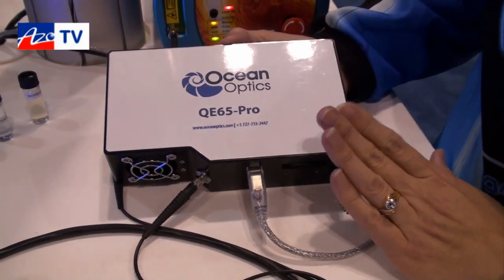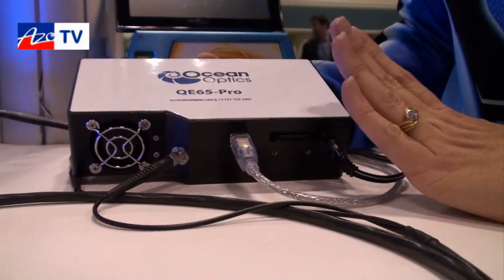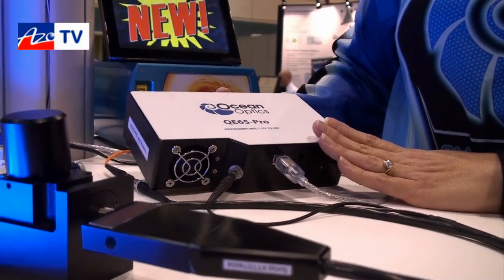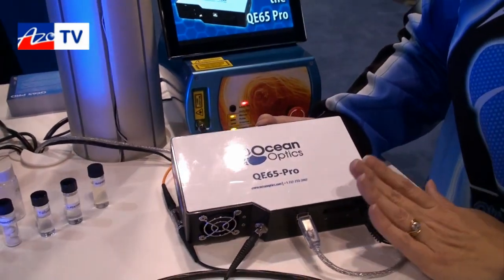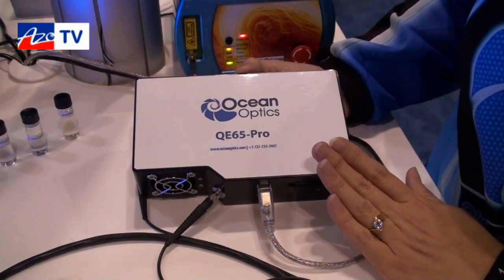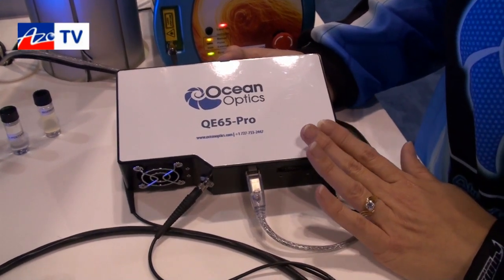This instrument is wonderful for low light level measurements like Raman and also fluorescence. What's great about this spectrometer is we have taken our great existing spectrometer, the QE65000, and added new improvements to make it an even stronger product. The QE65 Pro, in addition to having the TEC cooled back-thinned detector from the QE65000, has been improved with optical bench design changes to give improved thermal stability.